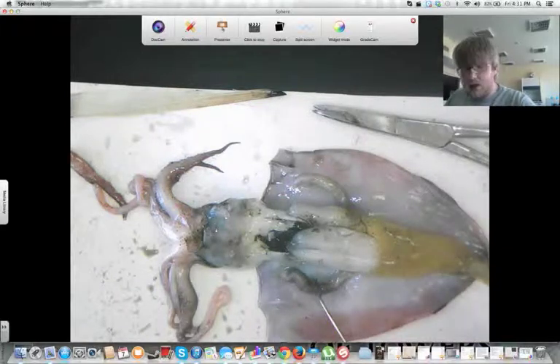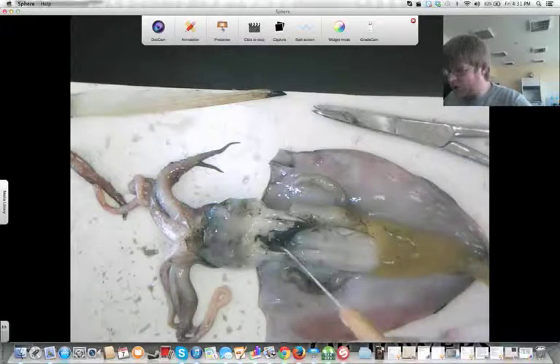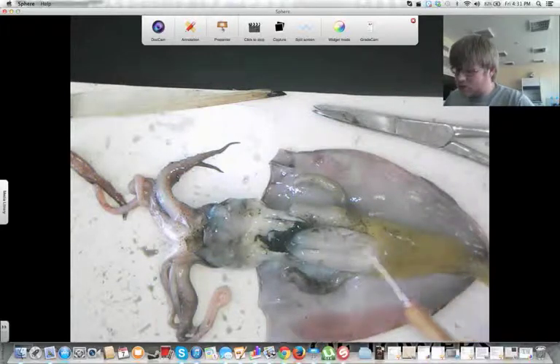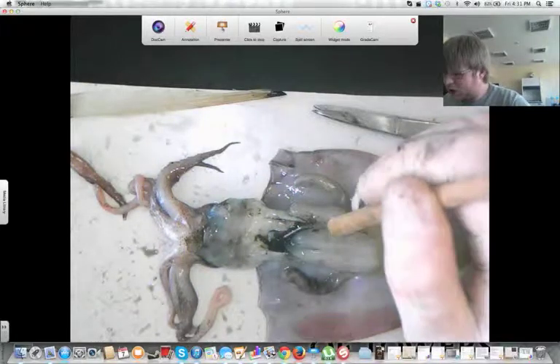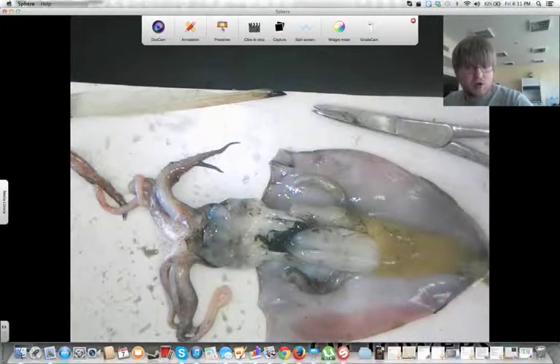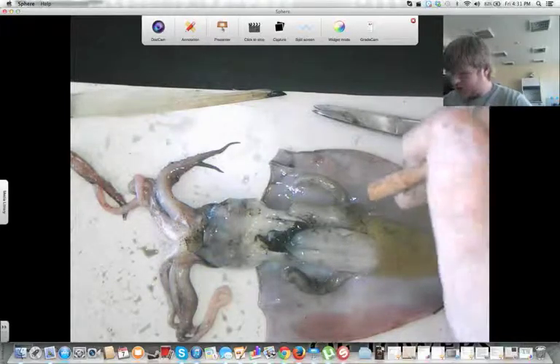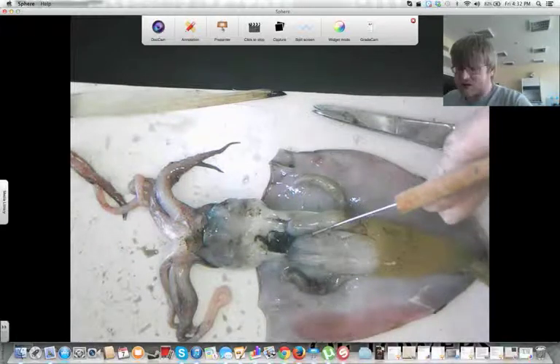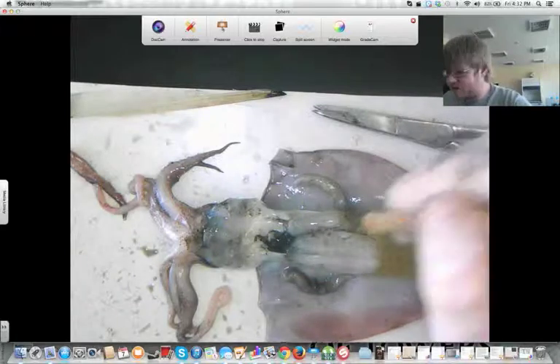To the sides, we have the squid's gills, which it uses to obtain oxygen from the water. As water comes in through the mantle, it passes over the gills and then circles back and is ejected out of the siphon. Underneath will be the ink sac, which you'll probably see as being a bit of a blackish silvery organ. The ink sac will eject ink into the siphon when the squid wants to make a quick escape and prevent its predators from following it.